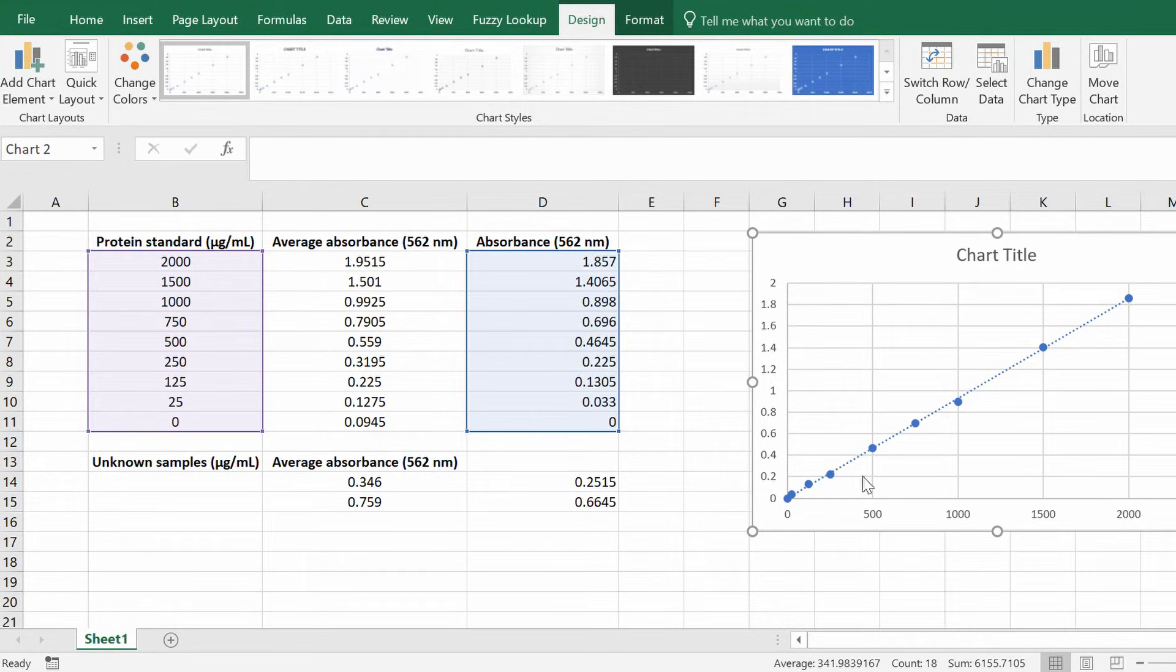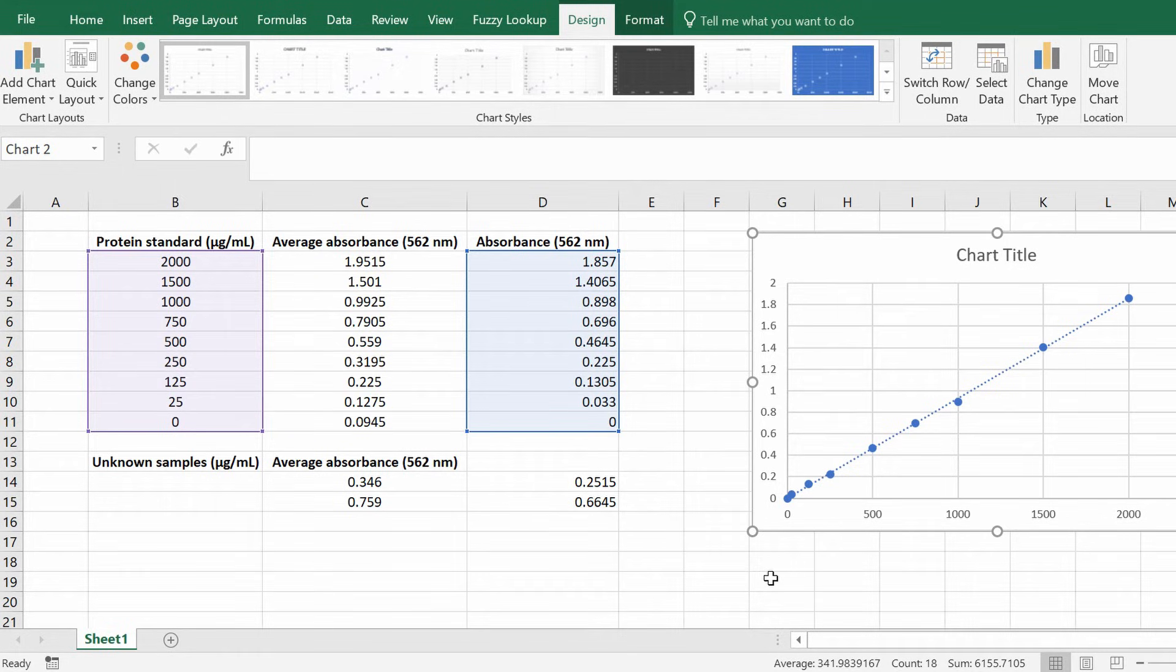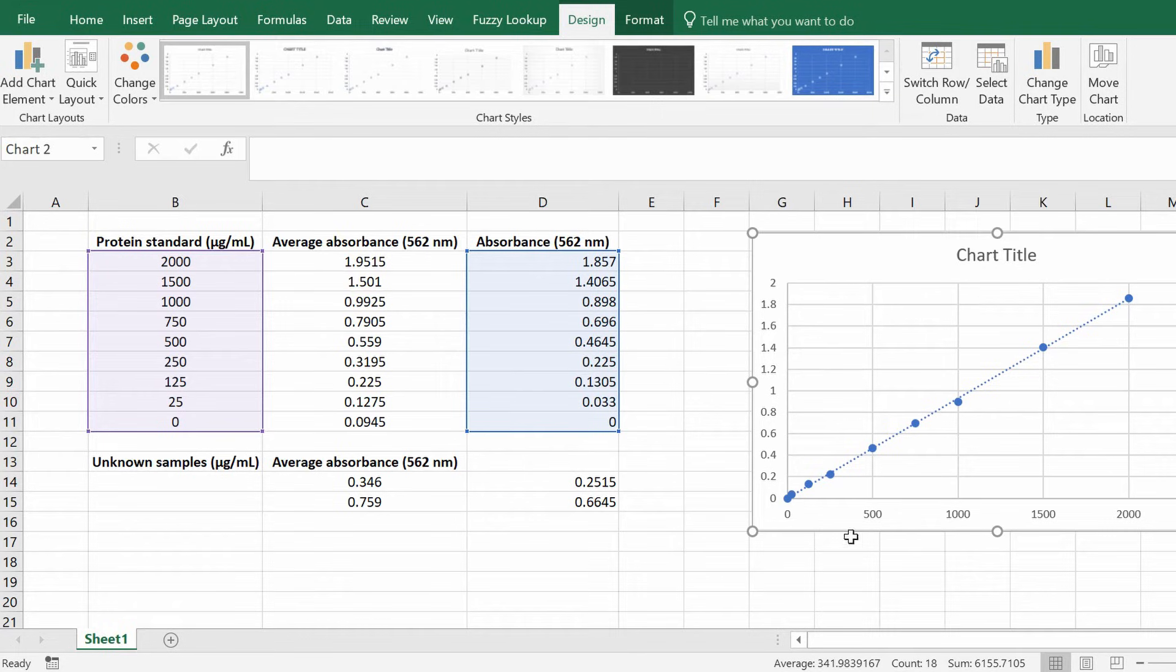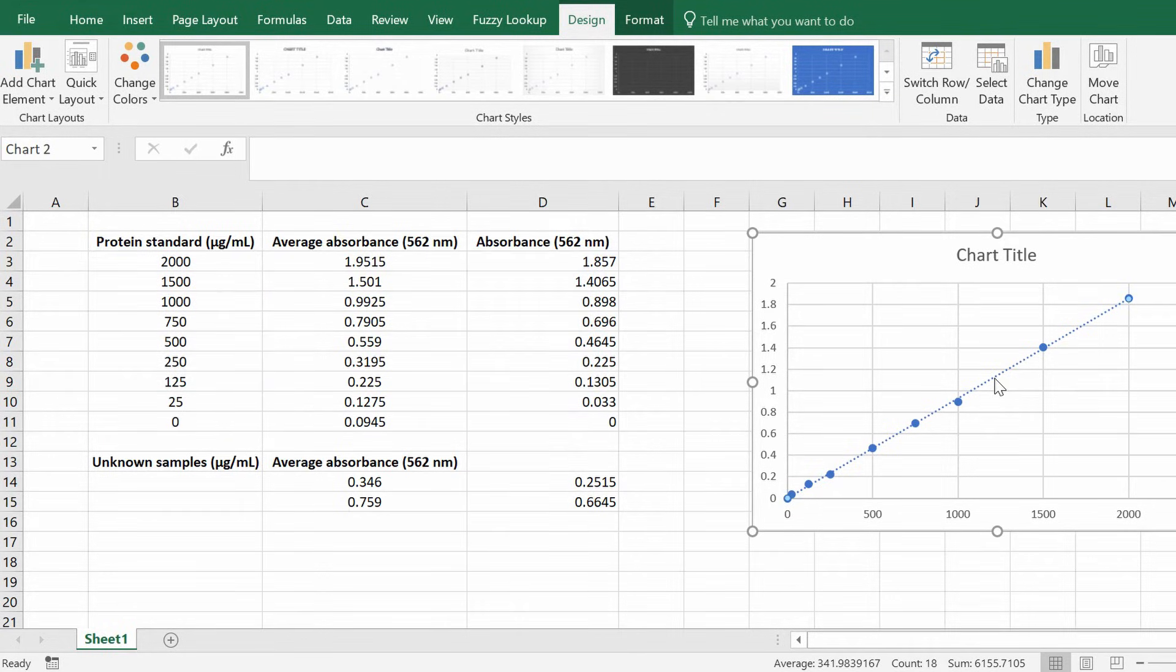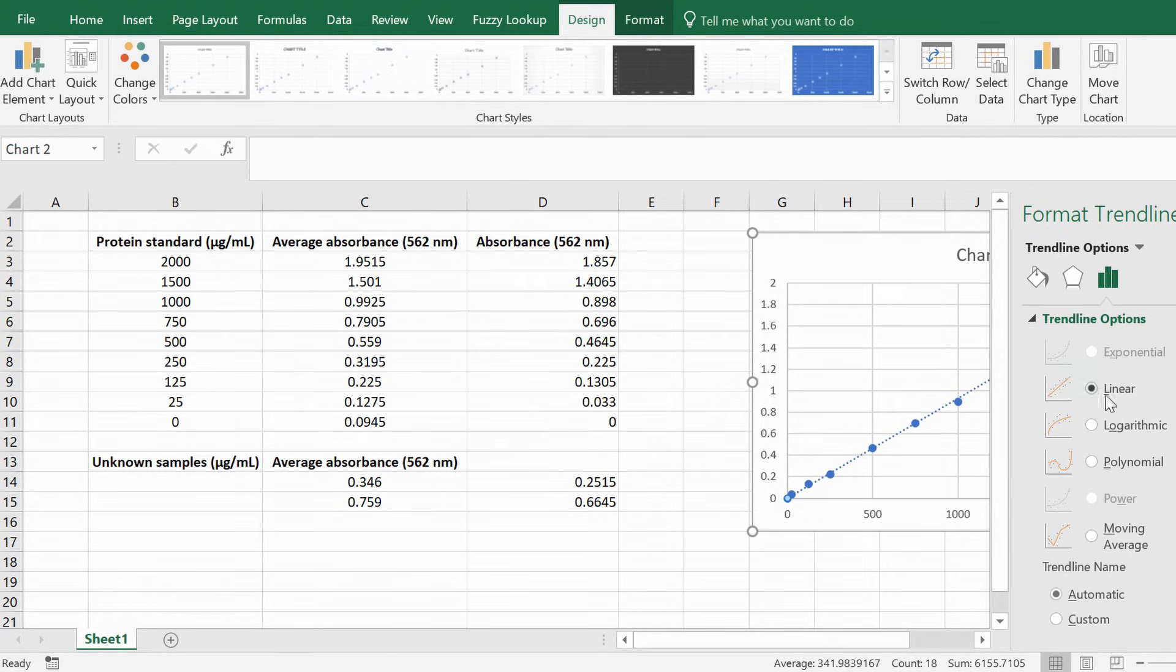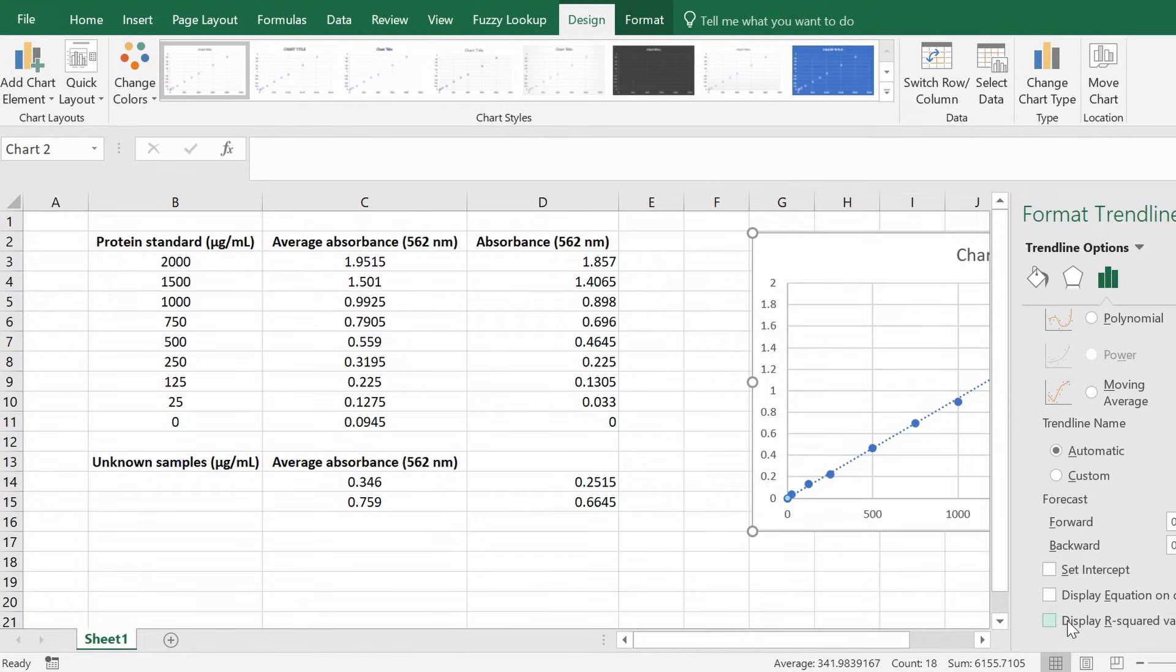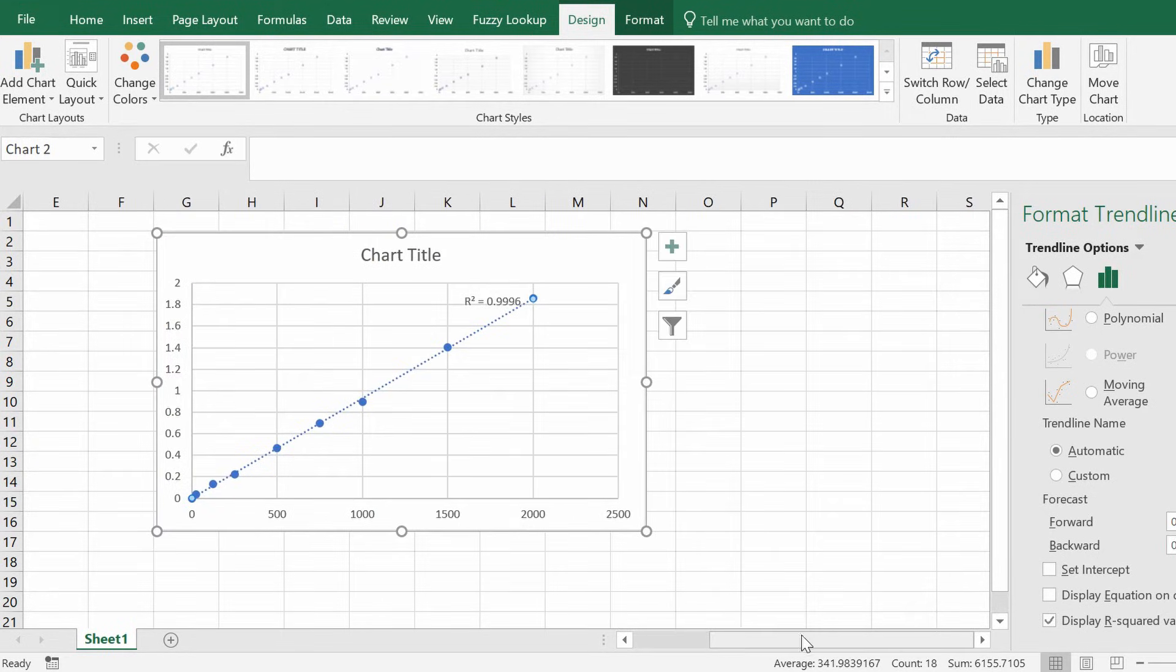But it's not very informative to us. So what we next need to do is get the equation. Because to work out the unknown concentrations we need the equation of the line. Now to do this if you double click on the line of best fit, what it will open is the format trend line options menu on the right hand side. If you scroll down you'll see that there's a few options you can do here.